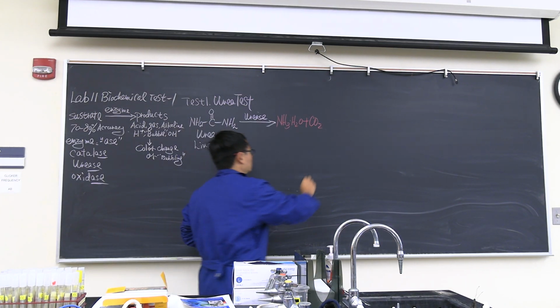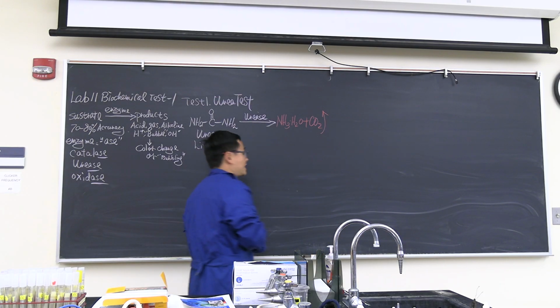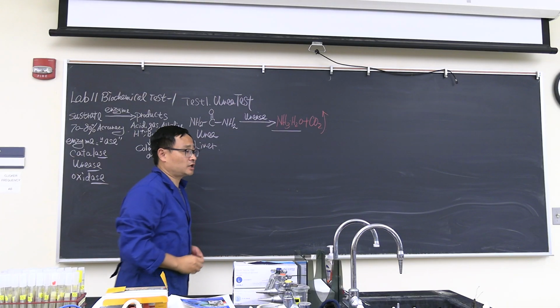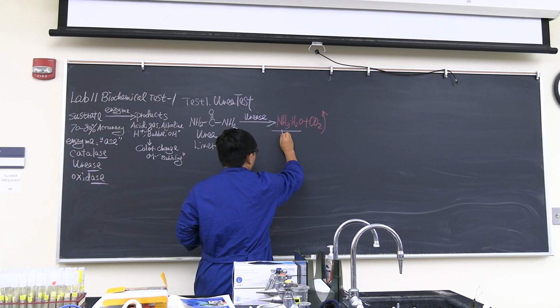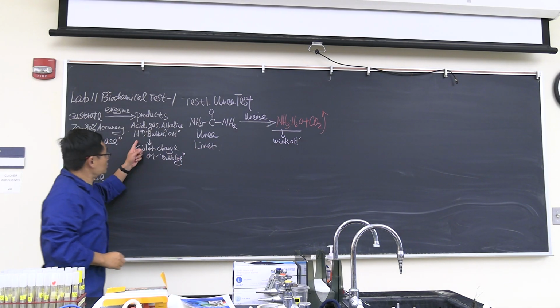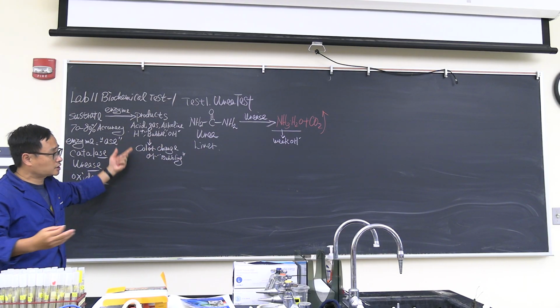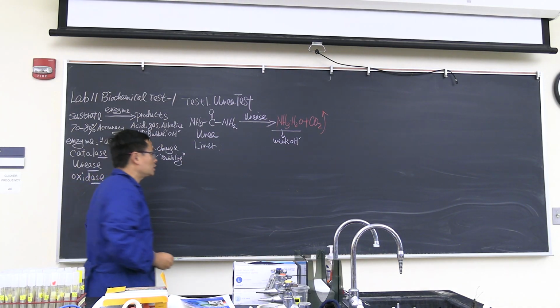The carbon dioxide usually it's a gas. Okay. This is a magic stuff. Ammonium weak alkaline. And I just said the products, if it's alkaline generated, it's going to change the color. Yes, it can change the color.